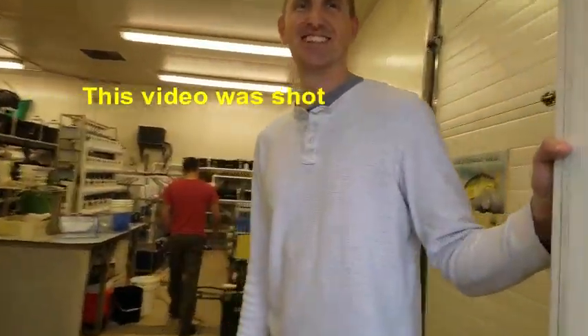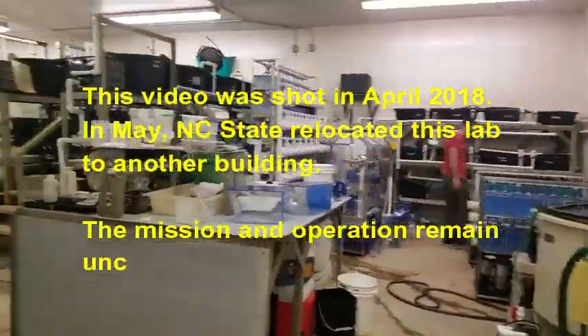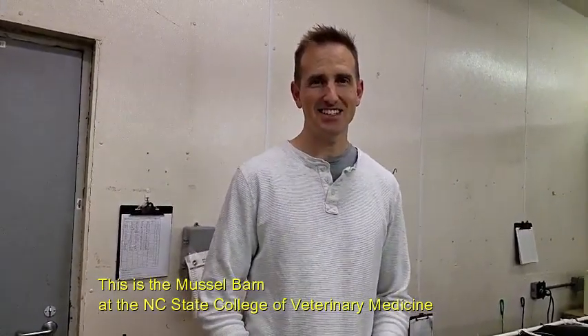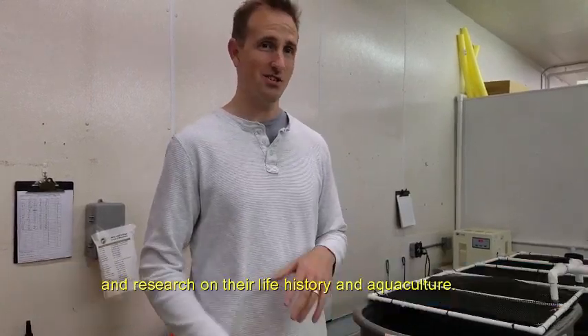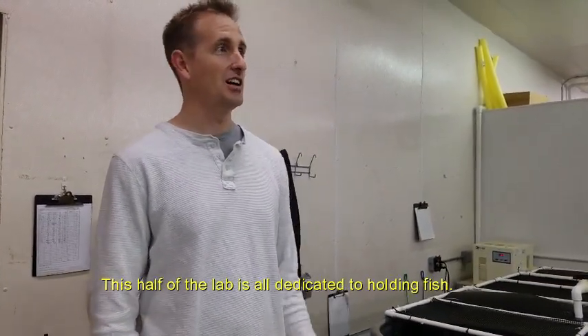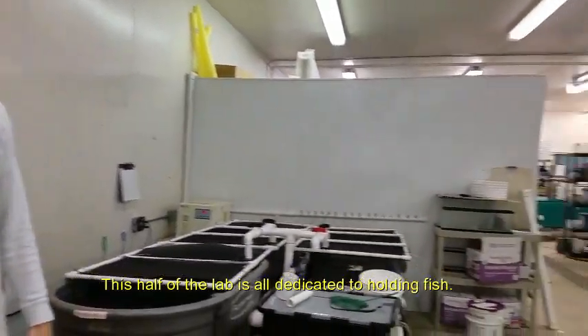Hi Chris. This is the Mussel Barn at the NC State College of Veterinary Medicine. If you'd like the tour now — show me around. So this barn is entirely dedicated to the propagation of freshwater mussels and research on their life history and aquaculture. This half of the lab is all dedicated to holding fish.